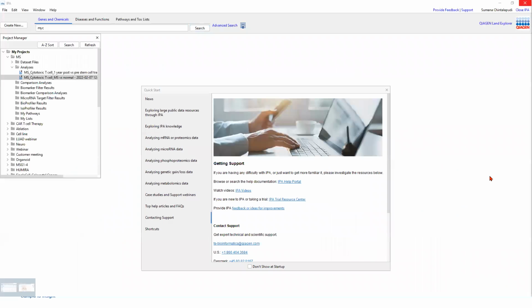So just with a raise of hands, how many of you have previously uploaded data within IPA? So I see at least a quarter of you have uploaded data into IPA. So I'm assuming that the rest of the crowd has not ever uploaded data. So maybe it's a good time to upload the data and look at the process.